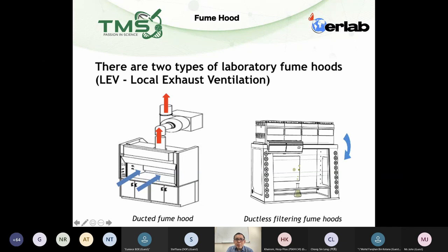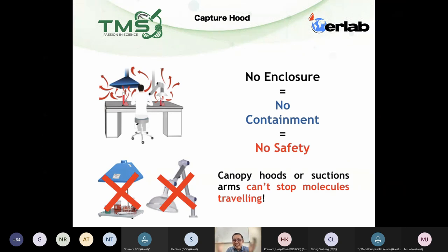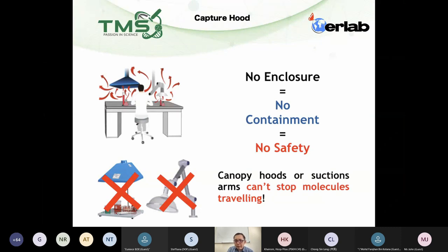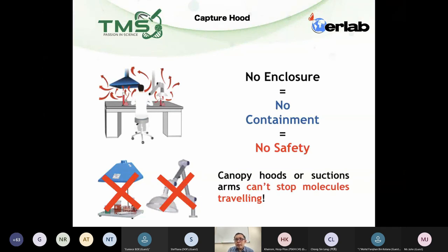These tools are the options you have. Most of the equipment shown here is in a box — a box-like enclosure. Why do we need a box to handle chemicals? Why not use something like a suction arm or canopy hood? We wouldn't say you can't use it, but it's not sufficient to draw out all the contaminants, because there is no containment.